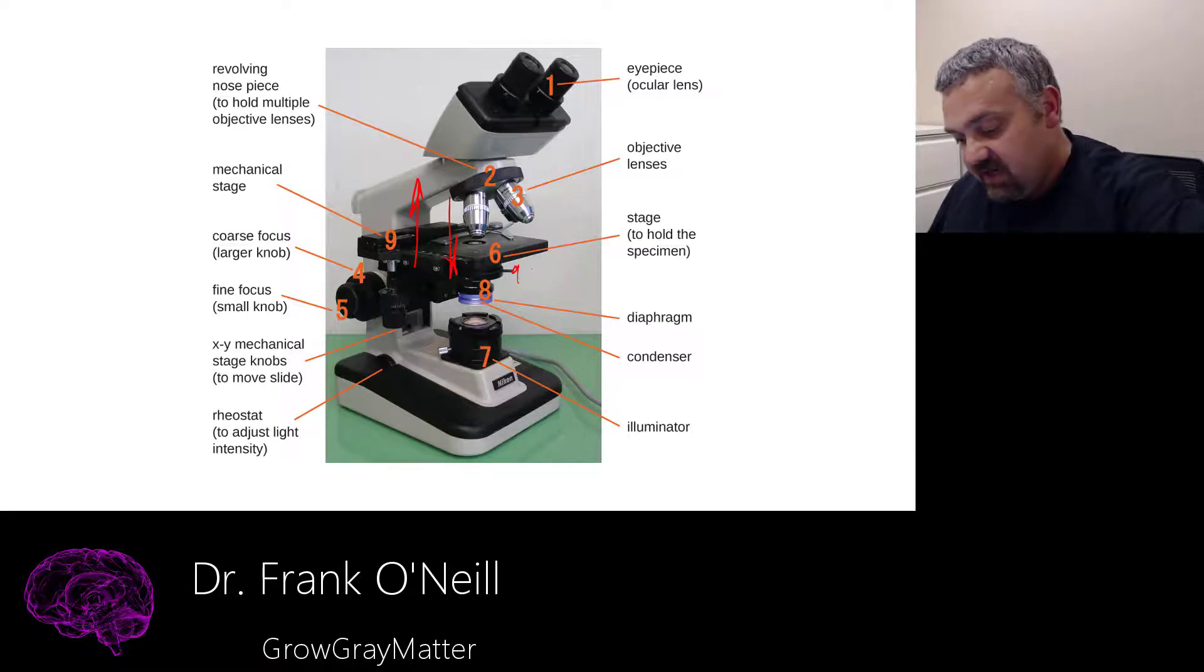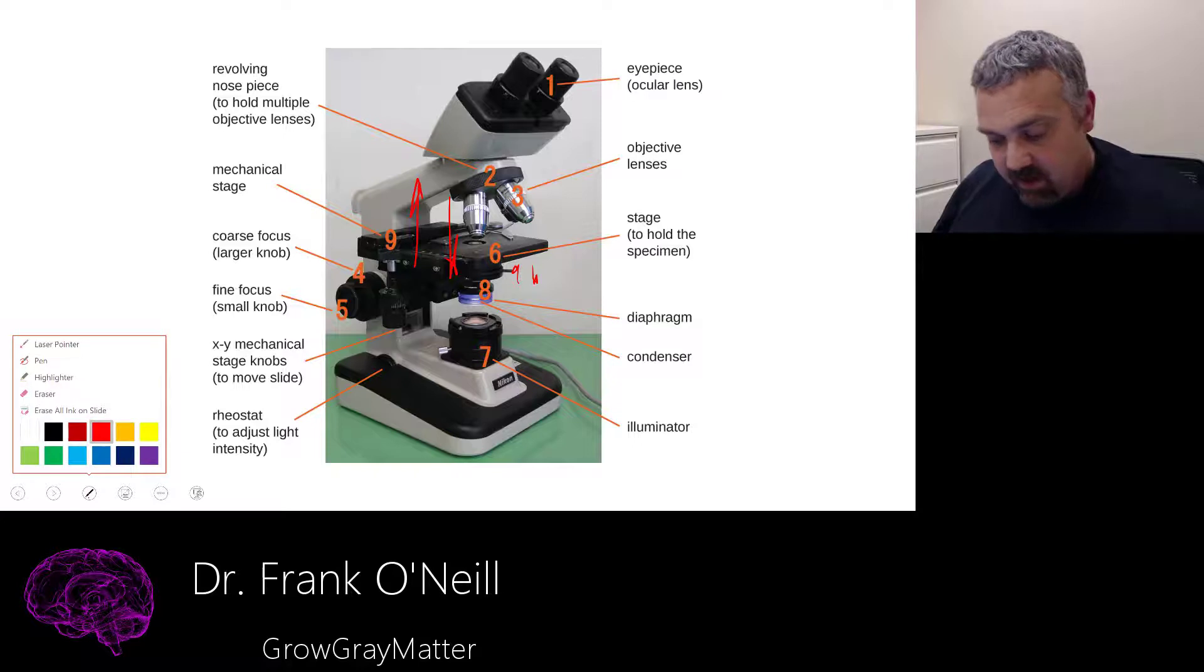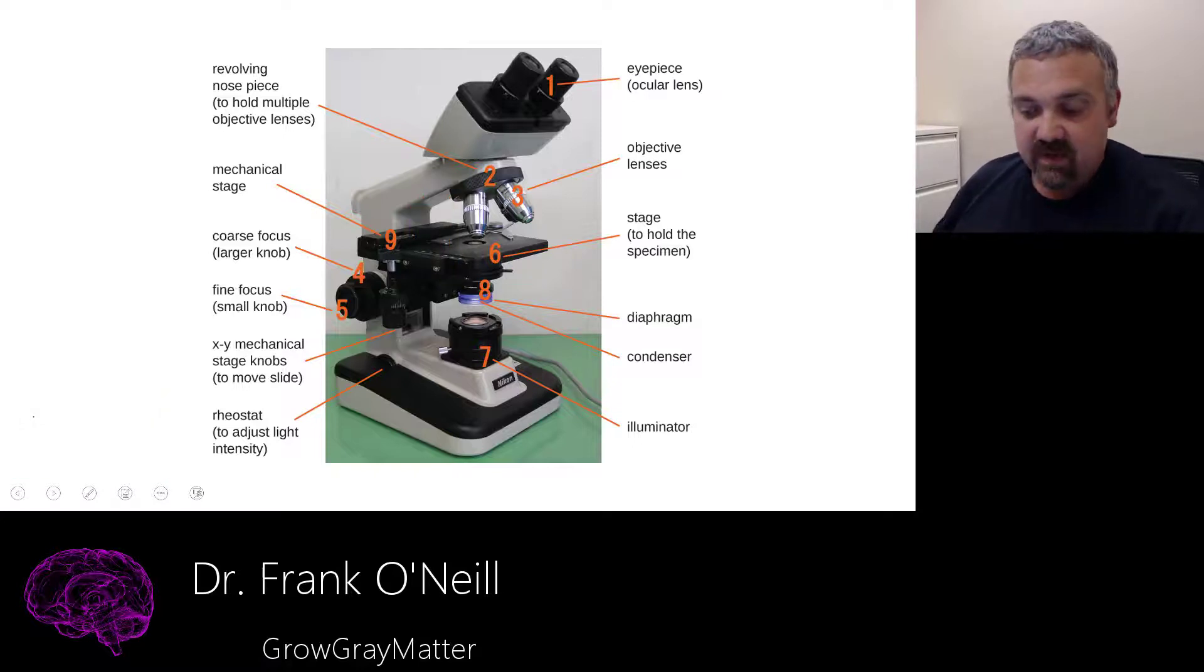And when you turn the fine knob, it's going to move just incrementally, tiny, tiny bits. So that's the coarse versus the fine knob. Both are very important. The coarse knob will get you in the right ballpark. And the fine knob will actually be where you do your focusing.